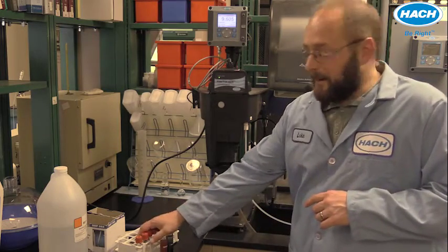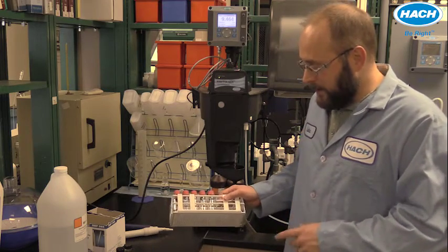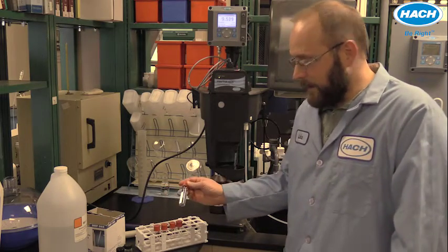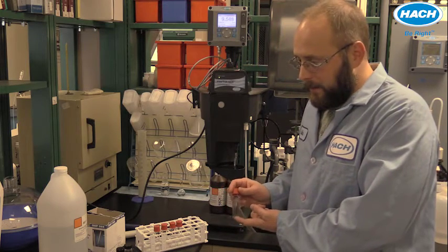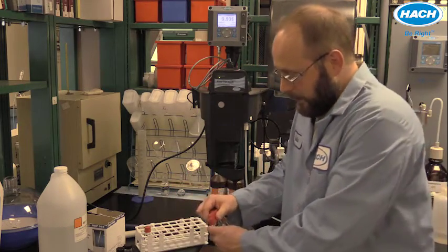So right now we're going to do the sampling here. I have these 5 20 millimeter vials that I discussed in the previous video, and I've marked them 1 through 5. The first one I've designated as a blank, and I've just filled this with high purity iron-free water. And now I have these marked 2 through 5.